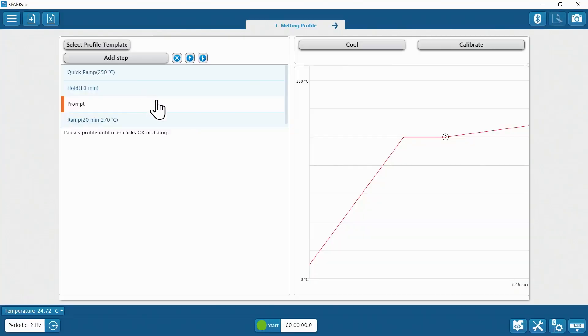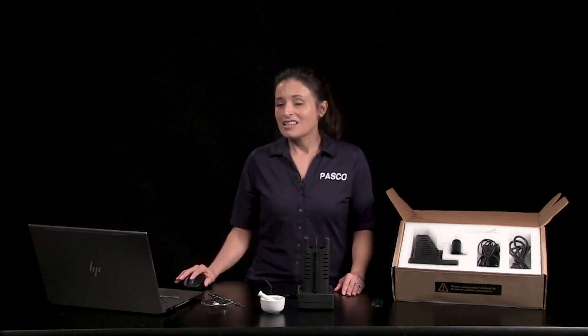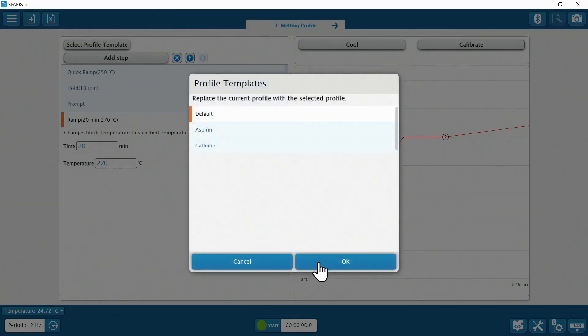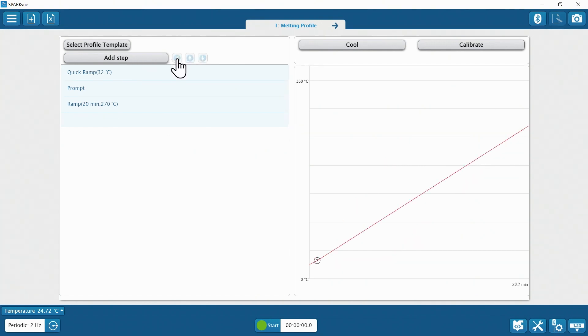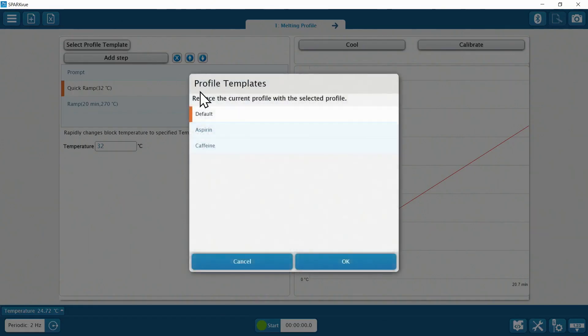Then once you hit OK, ramp begins where heating will resume and the sample will go through the beginning and end of melting. To customize the heating profile, you can select a different preset profile template, change the value of a heating profile step, add or remove profile steps, or reorder steps in the sequence. The preview graph updates itself as changes are made. To return to the original profile steps, choose the default template.